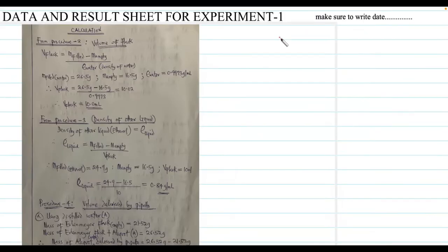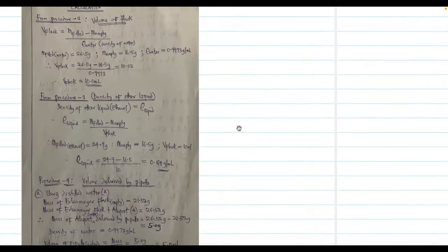Okay, now we want to look at the volume delivered by the pipette.